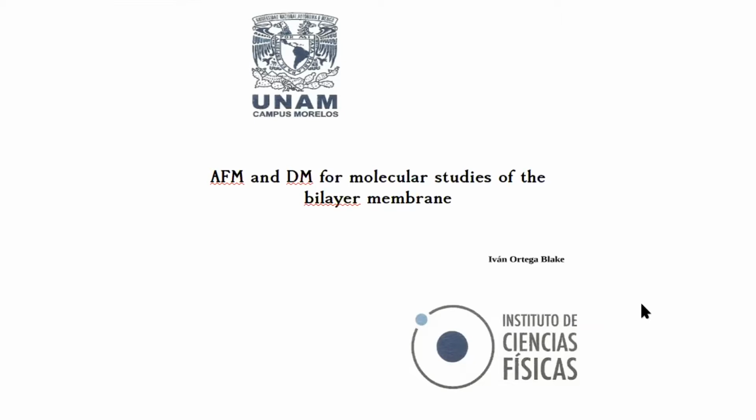So I will be talking about using AFM and molecular dynamics for the studies of the bilayer membrane. Okay, in many biology books, you see this image.